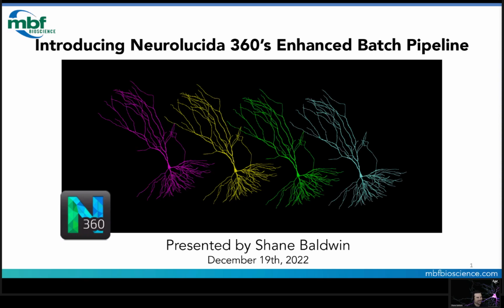I'm sure we'll have a couple more people join in the next couple seconds, but what we're going to do today is run through what's included in our new enhanced batch pipeline, how to use it, and then at the end we'll do a little Q&A with product manager Macy Heel.